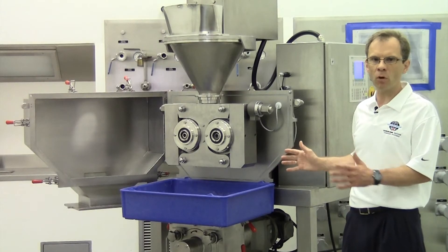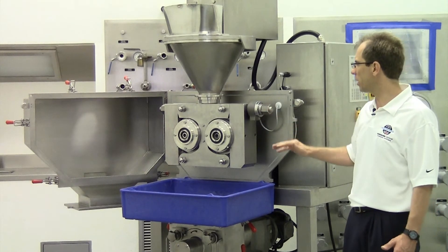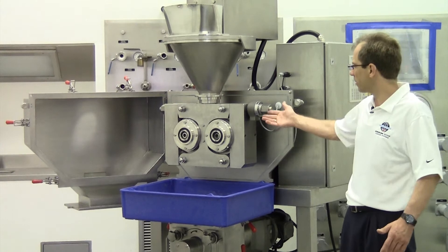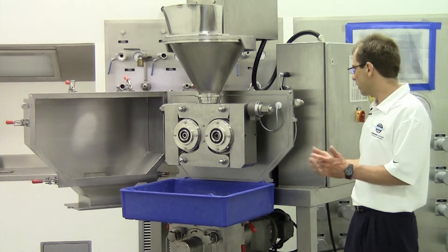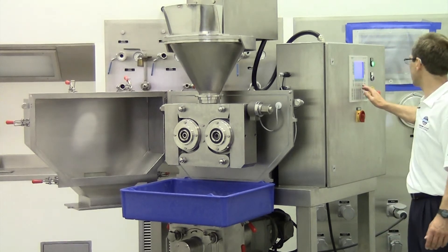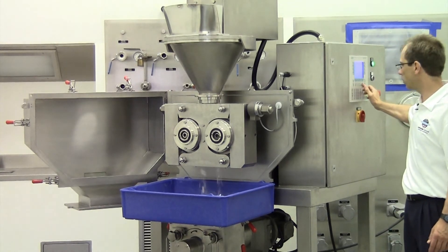This is only for demonstration purposes. Normally you would never run a machine with an open lid because it's dangerous — we have some turning parts and dust can come out of the machine. Now I'd like to start the machine, starting with the rolls and with the screw.